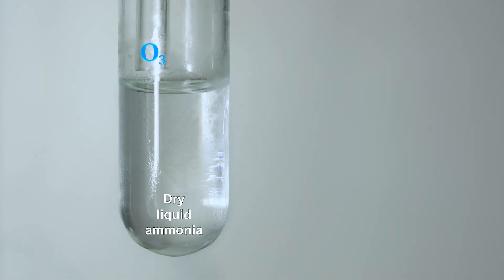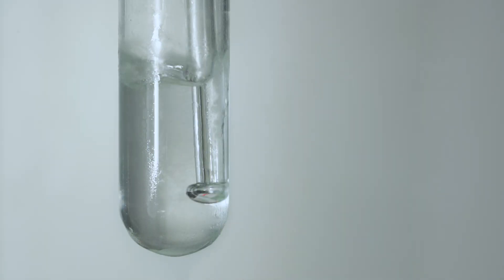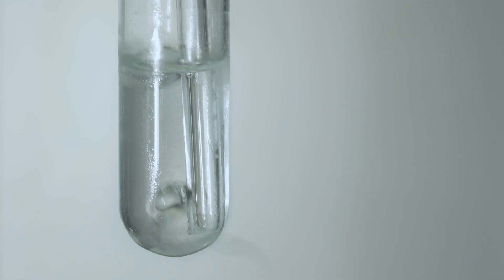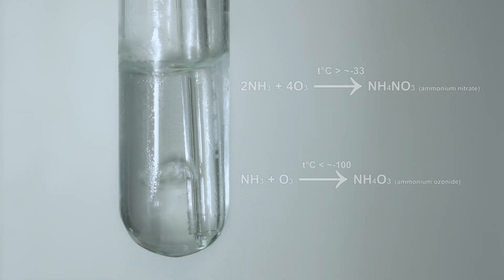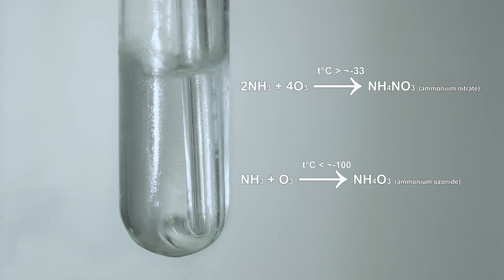If we bubble ozone through liquid ammonia with a temperature a little bit lower than minus 30 degrees Celsius, we will see no changes. Because liquid ammonia reacts with ozone either at higher temperatures, forming mainly ammonium nitrate, or at lower temperatures, forming bright red ammonium ozonide.